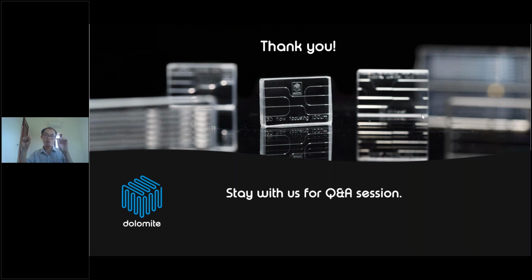The output of our system is just one tubing containing the product stream. So you can dilute the sample by using one of our pump channels and another chip for dilution, and connect directly to the post analysis equipment like the particle size measurement.